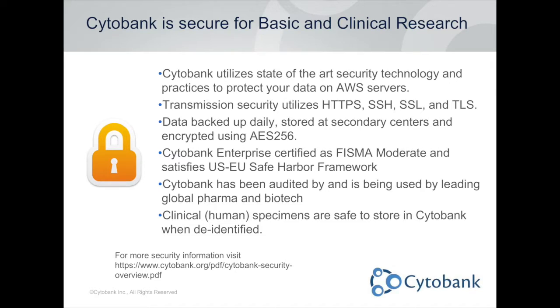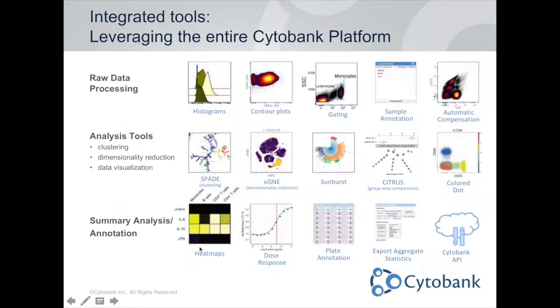Cytobank is designed around security. Our servers are hosted on Amazon's cloud, AWS, and you can see several other details here about the security practices we entail. If you'd like more details, they're available here at this URL.